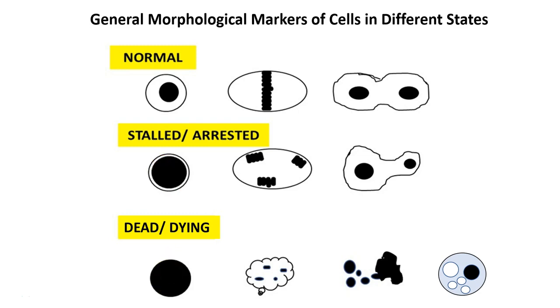This is just a dark blue or darkly stained cell membrane with nothing inside that you can see clearly, so the nucleus has already disintegrated. That's one way it can show up. These balls are typically much smaller than a typical cell because they have gone through enough destruction in the process of dying that what's left is a small cell body.